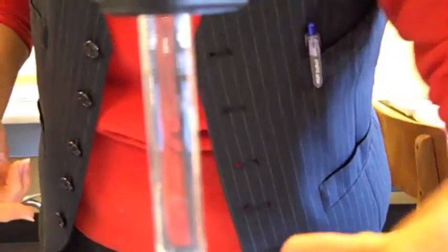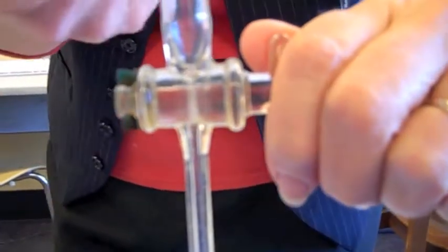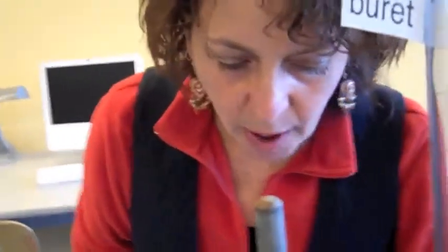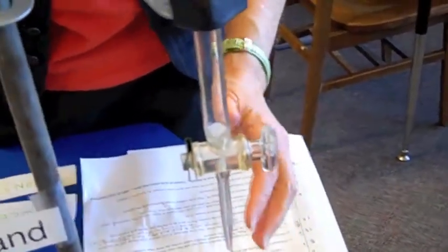We're going to be pouring some hydrochloric acid into this burette. Down here, there's this cool little fixture which you turn and you're able to drop hydrochloric acid or whatever liquid is in the burette drop by drop. Now, when you change the chemical property of something drop by drop like that, and you change its basic chemical character, in this case going from a base to an acid, that process is called titration.